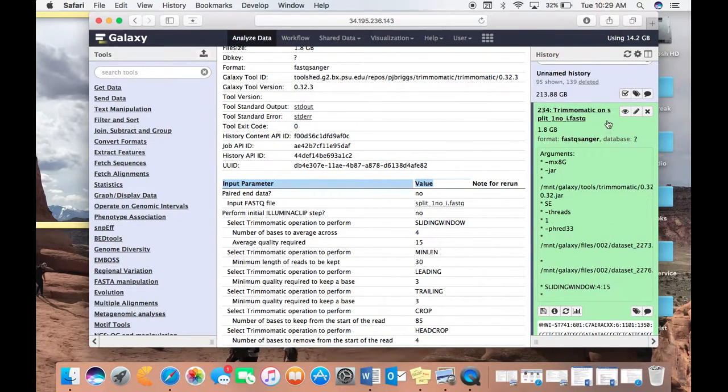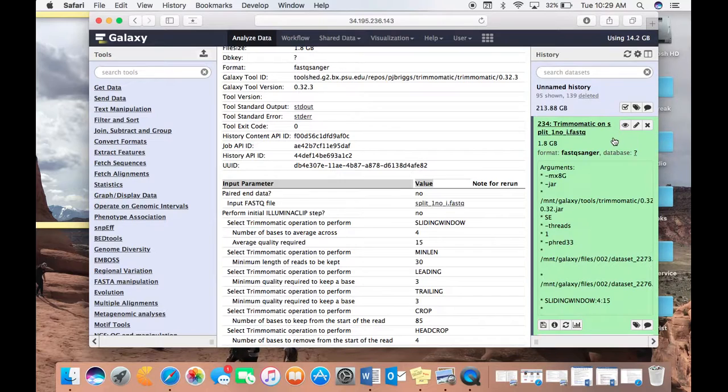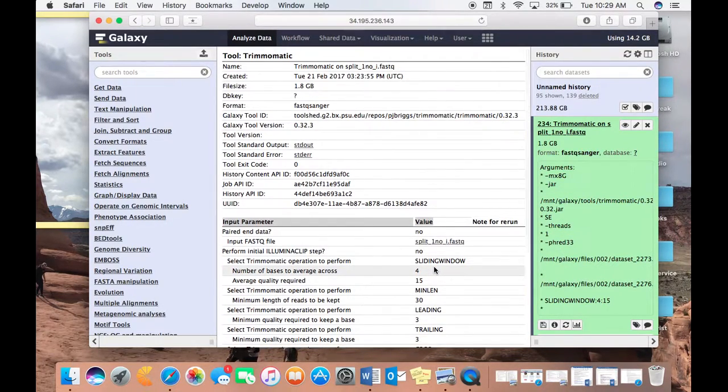So I encourage you to be mindful of keeping track of your parameters or leaving your files in your history as you go on to modify the data further. There'll be some alignment, and then your sample files will be different from what they were in this step. So either keep track of the parameters you're using or just leave the files available in the history so you can go back and view the parameters you selected in case there's ever any question.